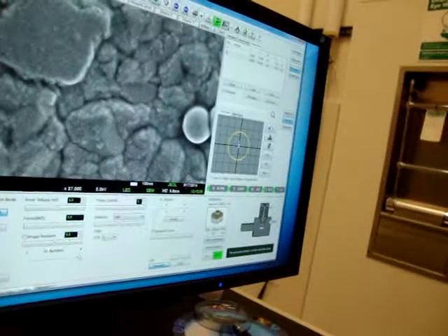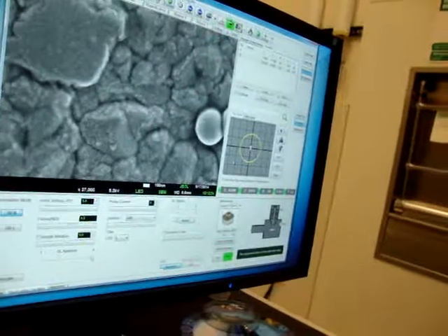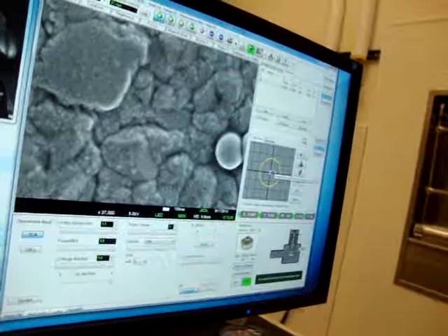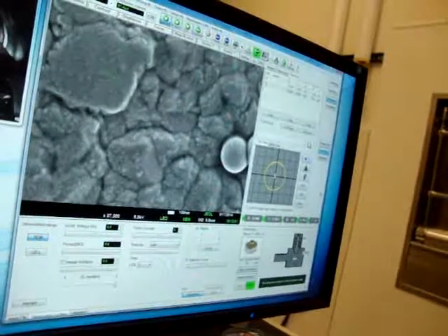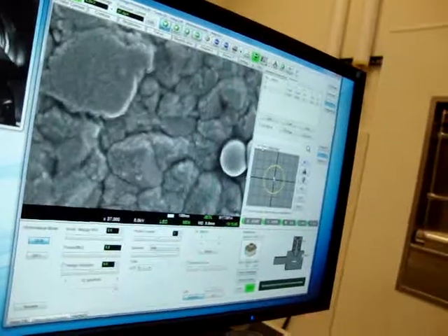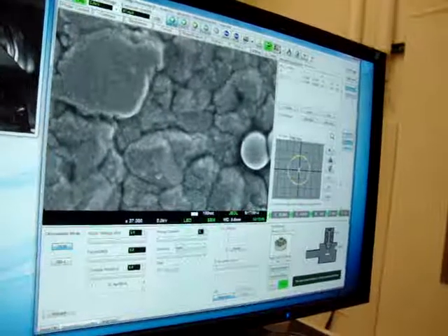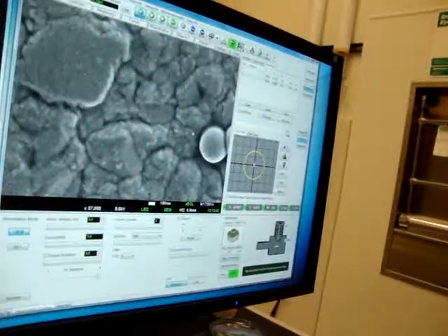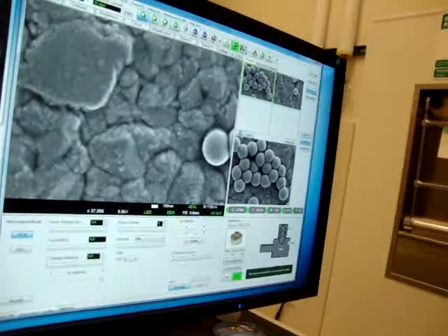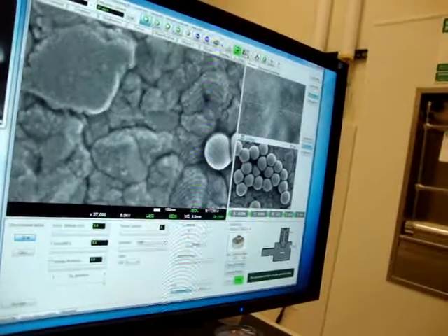Stage map. Usually I look at this and then I go wherever, and you can add your location in here, right? Yes, it has to do with, especially for those samples that you're looking at on edge. And that's where you draw your line. Navigation.